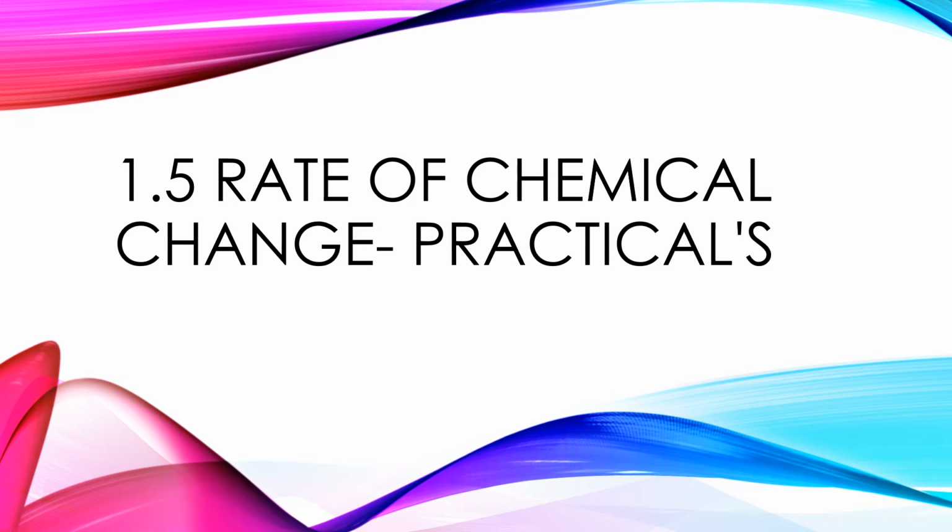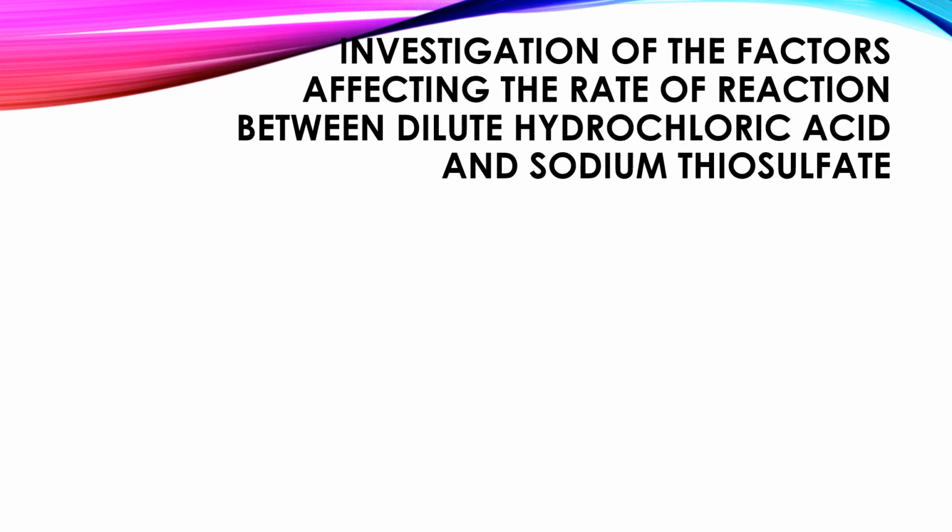So for this PowerPoint, we are going to be talking about the practicals associated with this module. This is the first of two reactions associated with this module. It's the investigation of factors which affect the rate of reaction between dilute hydrochloric acid and sodium thiosulfate.